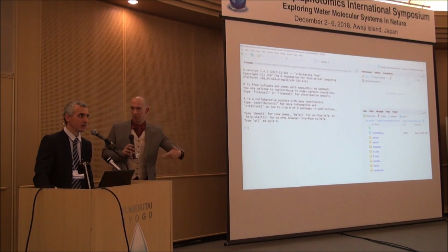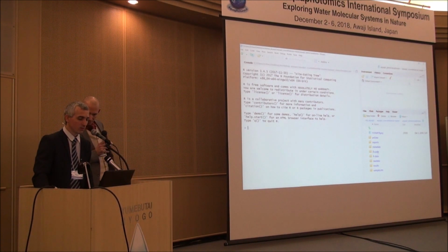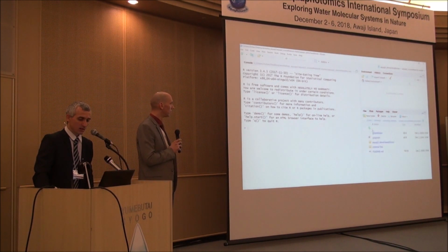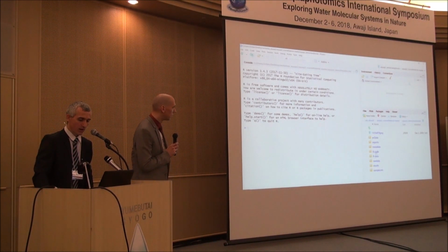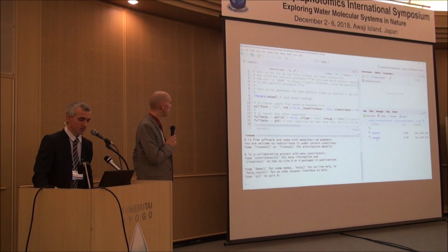Okay. Without going into details, what we will do now is open the code we will go through. It contains the instructions on how to do the data analysis. So please, in the bottom right corner, there is a window; choose Files, and inside this window you will find R code. And inside R code, please open routine2.r, just by clicking on it.